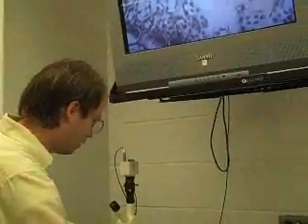Okay. Our next experiment was to make a slide of another view of the stomata. We did it by painting some clear fingernail polish on the underside of a leaf. Then we peeled off the fingernail polish and made a wet mount slide of it to see an impression of what the stomata look like. Put one on so we can see what it looks like. Zoom in. Okay.